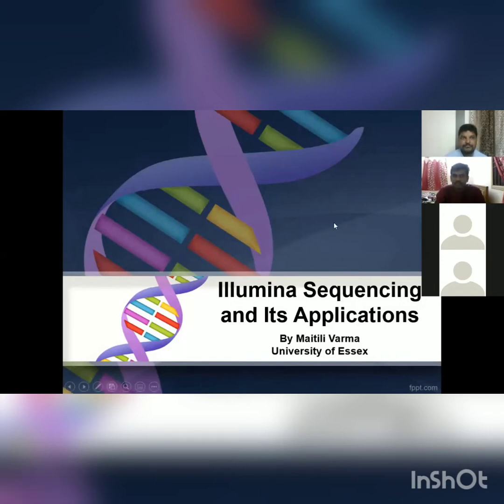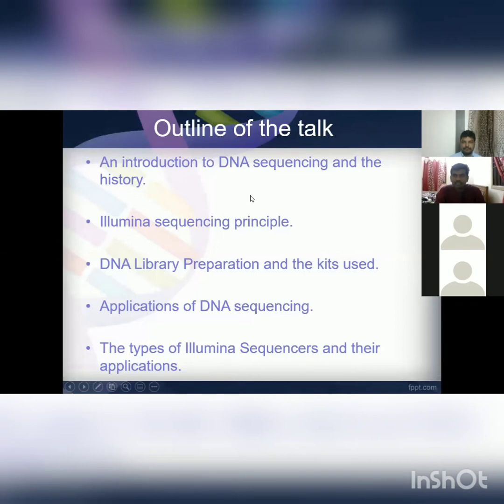I will be presenting Illumina sequencing and its applications. And this will be the outline of my talk. I'll be talking about an introduction to DNA sequencing and the history, the Illumina sequencing principle, the DNA library preparation and the kits used, the applications of DNA sequencing, and the types of Illumina sequencers and their applications.